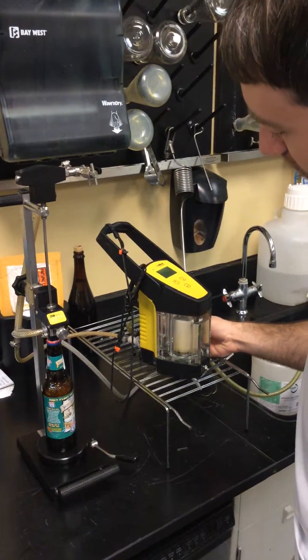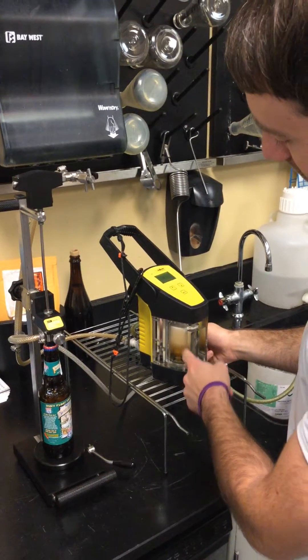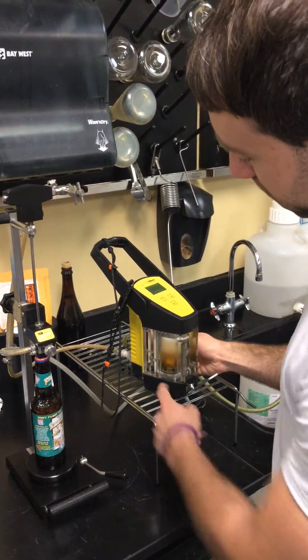Let it rise. Slowly open your valve and close it, and as you can see the foam is dissipating. Slowly open your back valve.